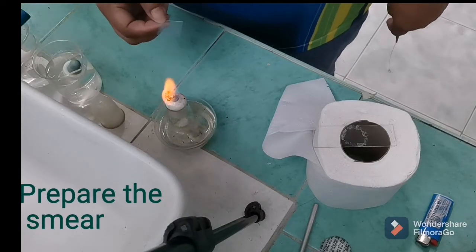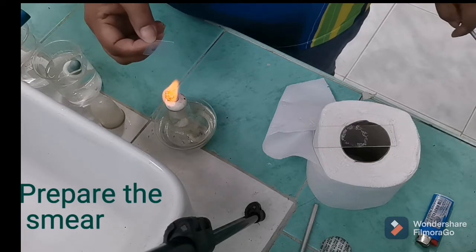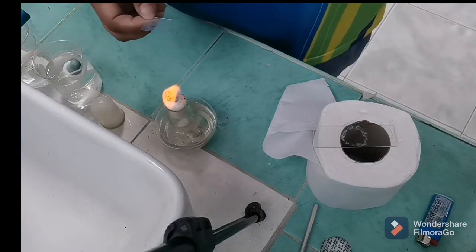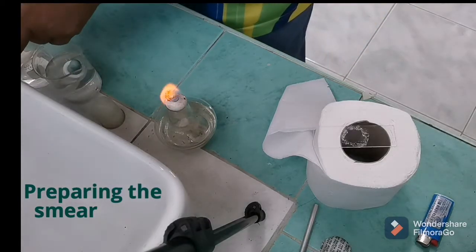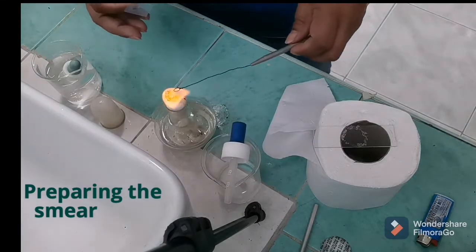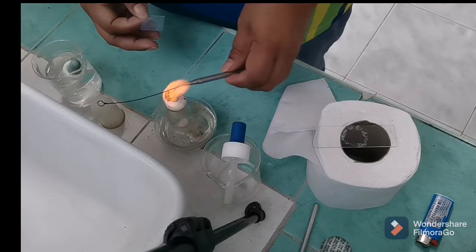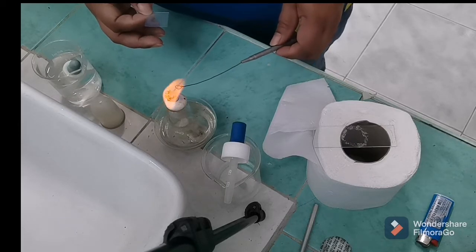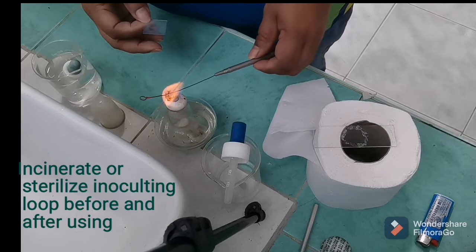Okay, the next thing for me to do is to prepare a smear over the cover slip. So using the inoculating loop, I will get some from the specimen sample, the same source of microorganism that we have used in the staining of microorganism. So I am right now incinerating the inoculating loop.